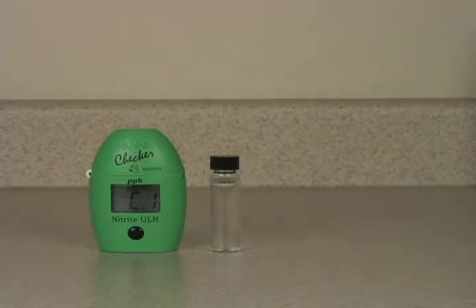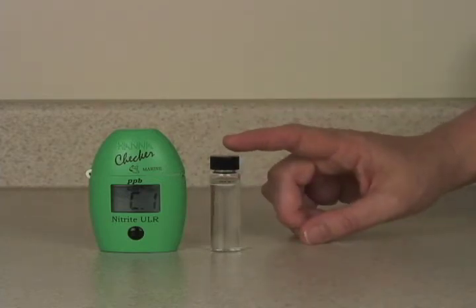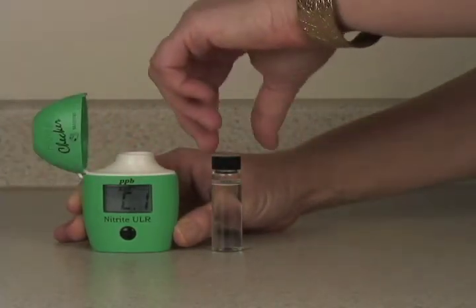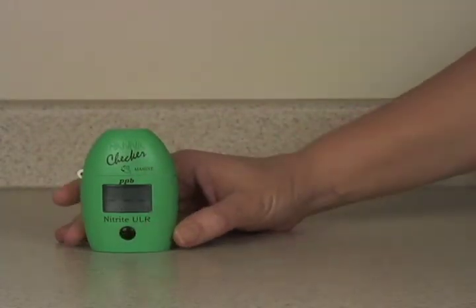Today we're going to go over how to do the test on the HI-764 Marine Ultra Low Range Nitrite Checker. We have a cuvette filled with 10 milliliters of unreacted seawater. We will put that in the checker and press the button once to zero it.